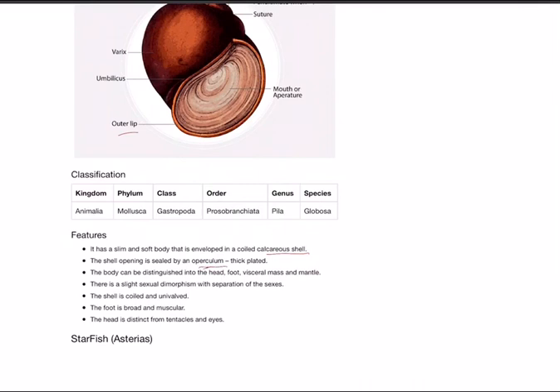If you have to see the animal, you have to break this shell. The calcareous shell itself is not the animal; inside there will be an animal. The shell opening is sealed by an operculum, a thick plated structure. The body can be distinguished into head, foot, visceral mass, and mantle. There is slight sexual dimorphism with separation of sexes. The shell is coiled and univalved. The foot is broad and muscular. The head is distinct with tentacles and eyes.